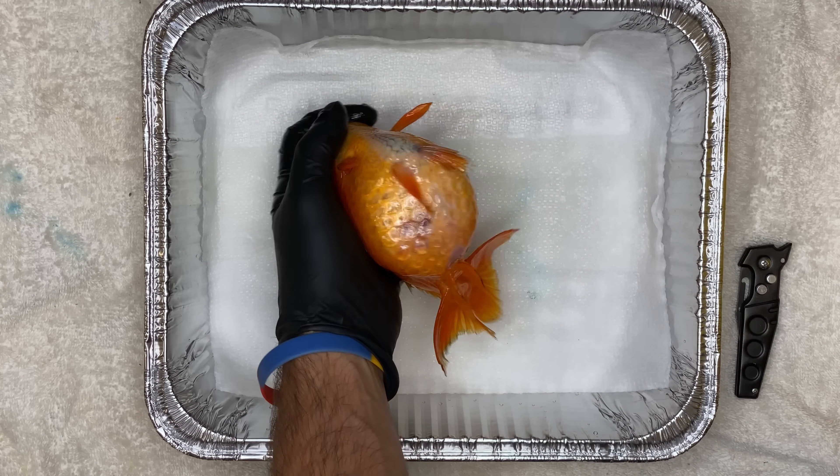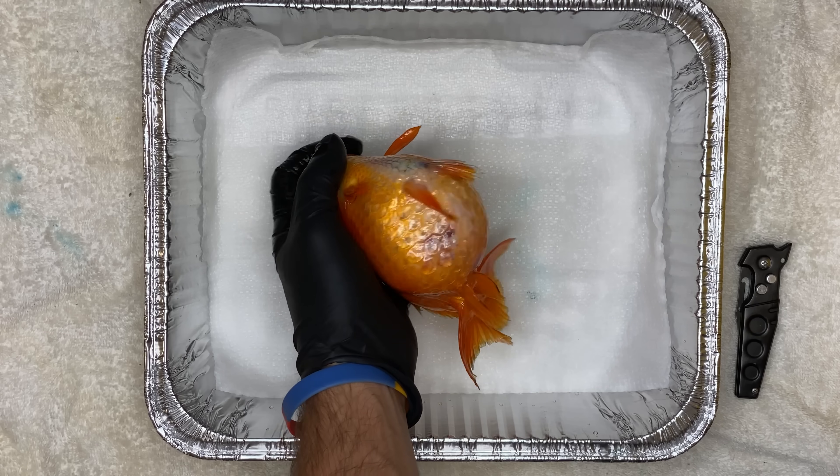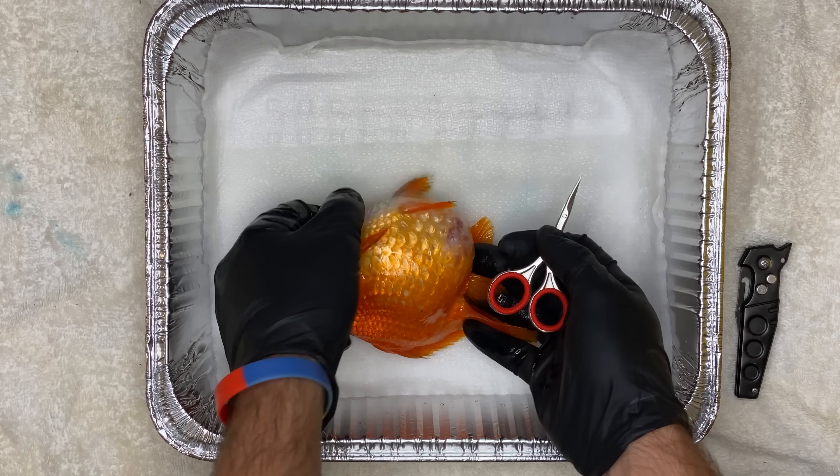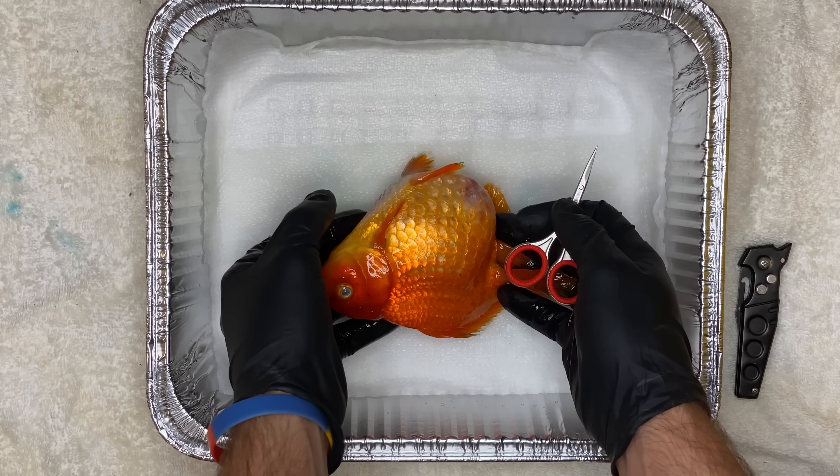I'm deciding to do a dissection to get a better understanding of the cause of death. As you can see, her body was like a fluid-filled water balloon. Definitely not healthy. She was very bloated up.